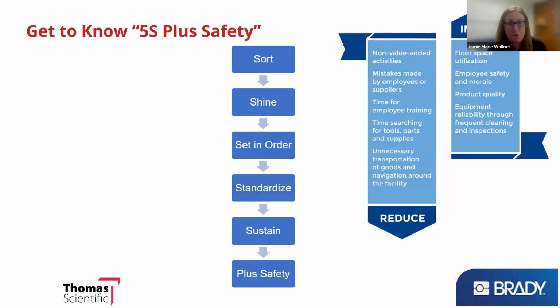And then on an annual basis, we're doing a huge lab clean out where we're looking to make sure that we don't have old chemicals sitting around. We don't have old supplies, old labels, that we can pitch and get rid of and move out of our space.